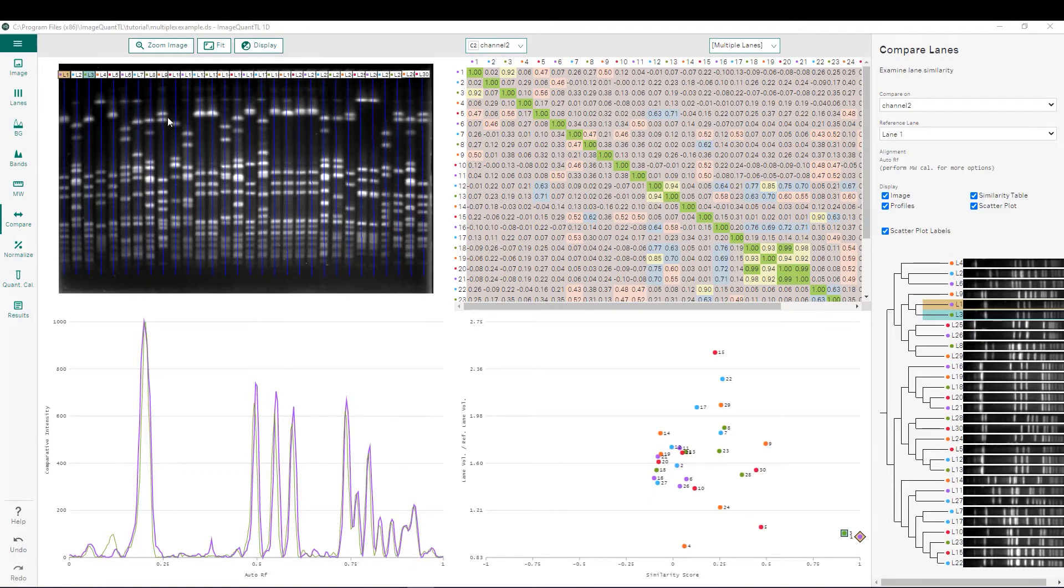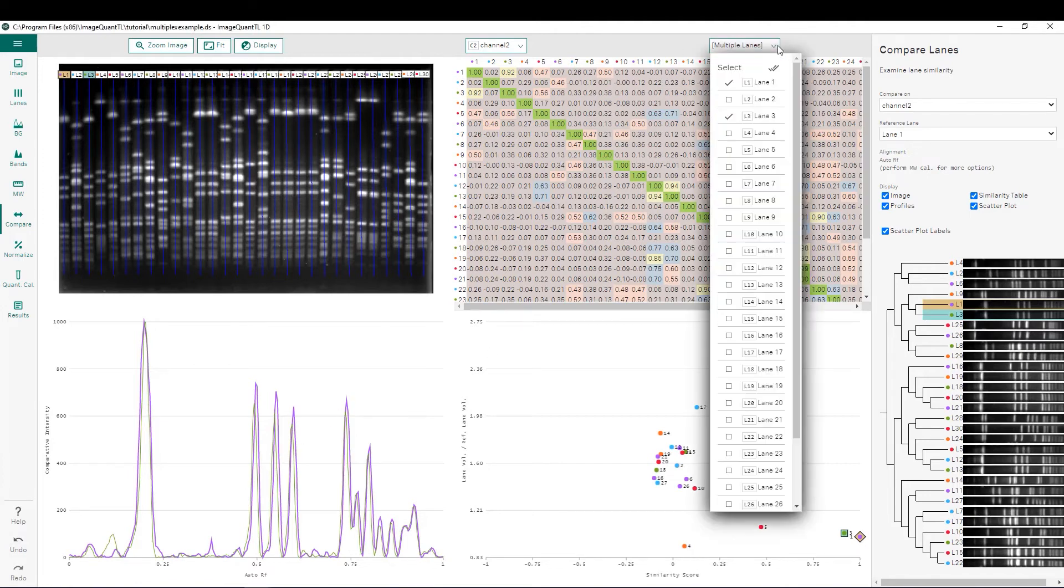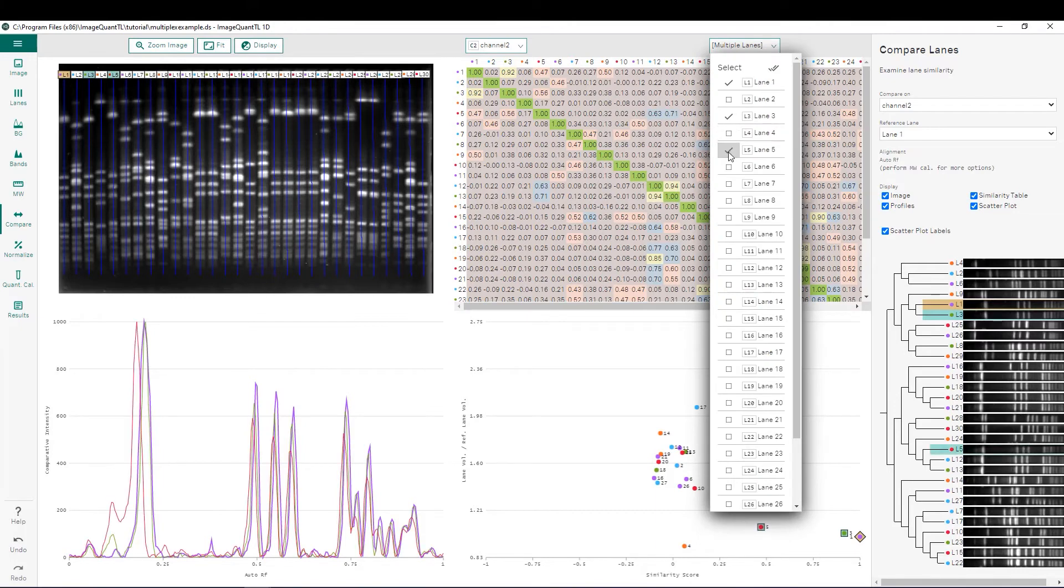In the interface we can see that we have the image that is being analyzed. Below this we have a lane intensity profile comparison where we can add or take away different lanes that we would like to compare.